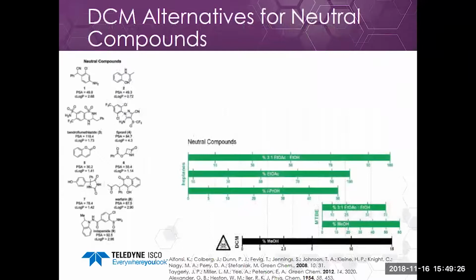So now specifically, we're going to show some work that's been done to implement substitution of dichloromethane in the lab towards chromatography purifications. There's been some really nice work done by several different groups here. We're going to highlight one of the guides, finding alternatives for dichloromethane methanol.